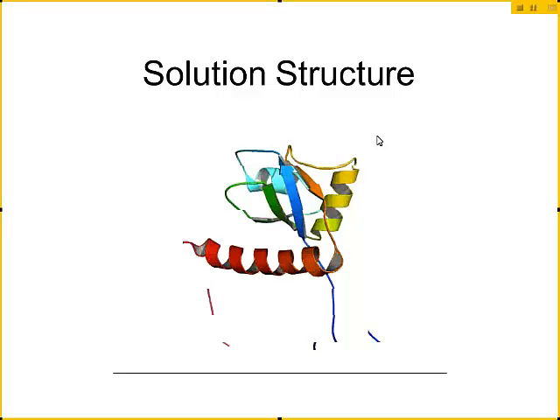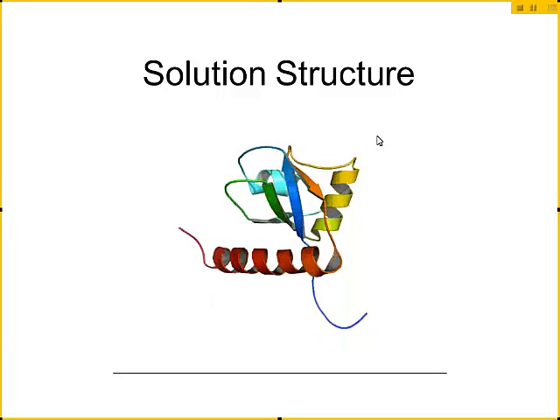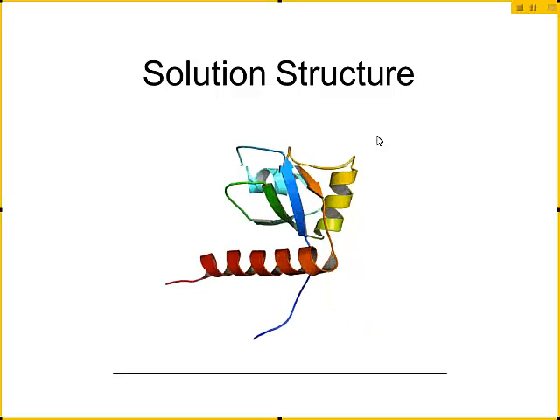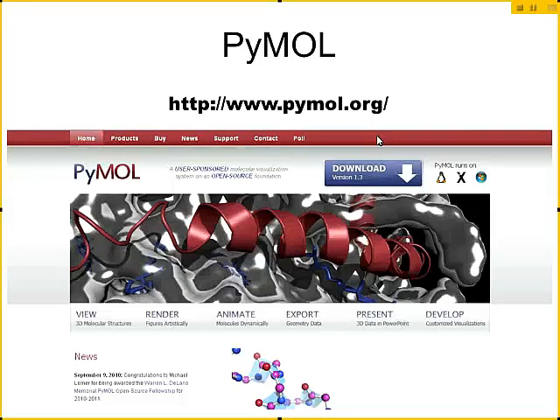If you look at all 20 structures, I made a little movie as I flipped through them so you can see the differences. The core of the protein is pretty well-determined and stable because of the restraints — that's a well-determined area. But the N and C termini ends are not restrained by contacts with the rest of the molecule, so you'll see that floppy behavior. With X-ray structures, these ends would qualify as missing atoms and would simply never be seen because the electron density is too spread out. Those are the issues with the solution structure.